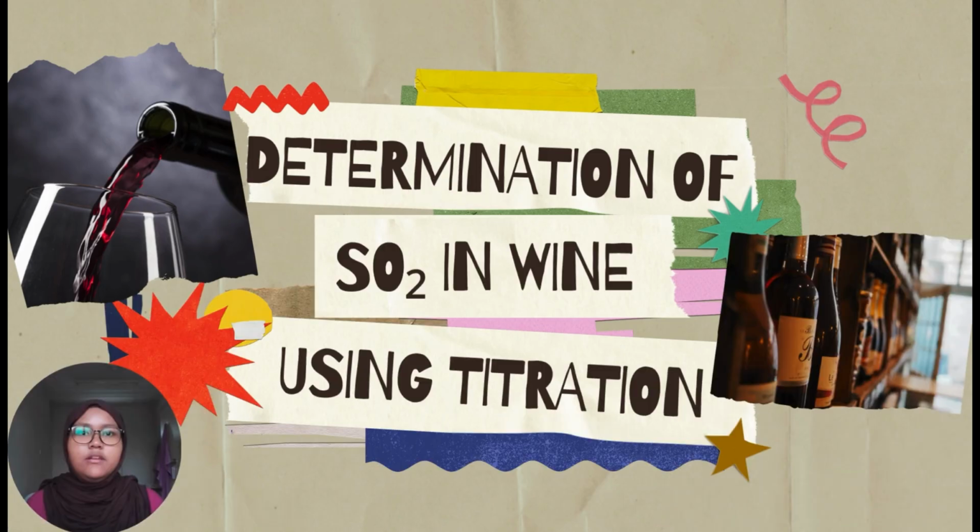Assalamualaikum to everyone. Today I will be presenting about the determination of sulfur dioxide in wine using titration. This topic combines food chemistry and analytical technique, especially how we can measure SO2 level in wine using titration method.